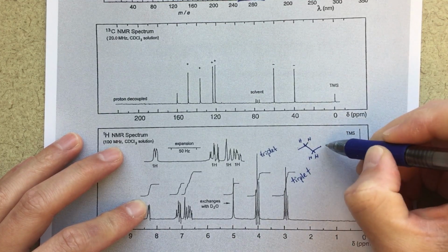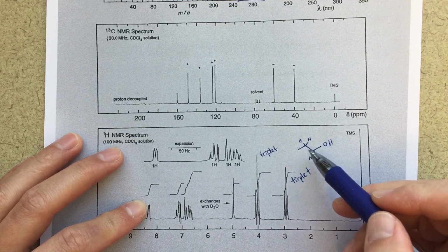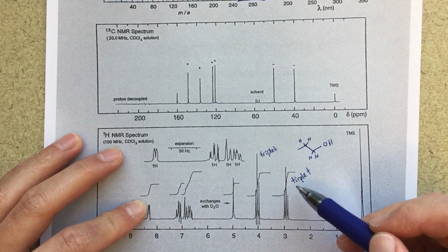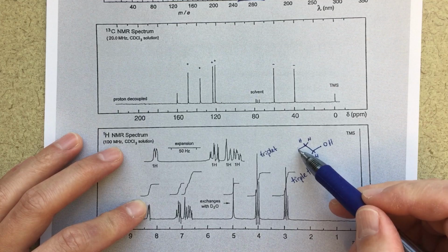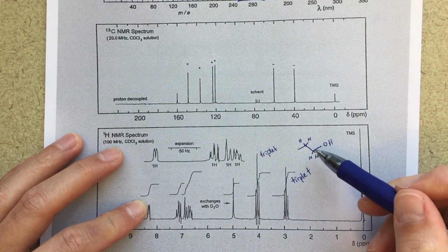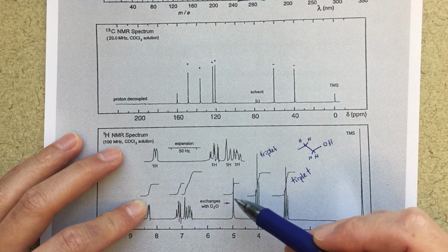And then since I know that there's an alcohol, I might go ahead and put an alcohol at one end, and then some other group's going to be off here, on my other end. But two CH2s, and I know that they're both CH2s because they're both splitting each other into triplets. And then here I would have no other splitting, because otherwise that would split this further, so it wouldn't be a triplet. But here, if you've got two high triplets, I think pretty clearly that indicates CH2, CH2. And I'm going to throw an OH on the end because I know that there's an alcohol here.